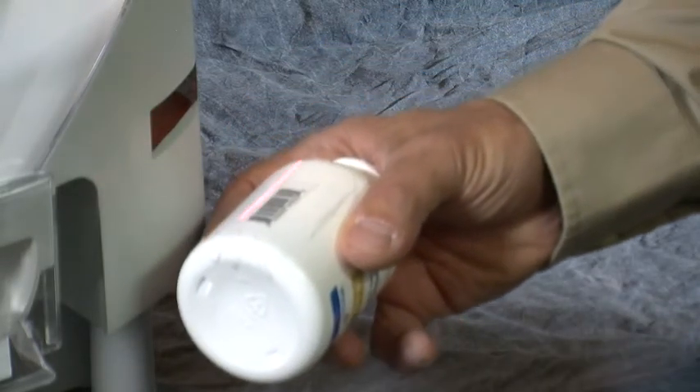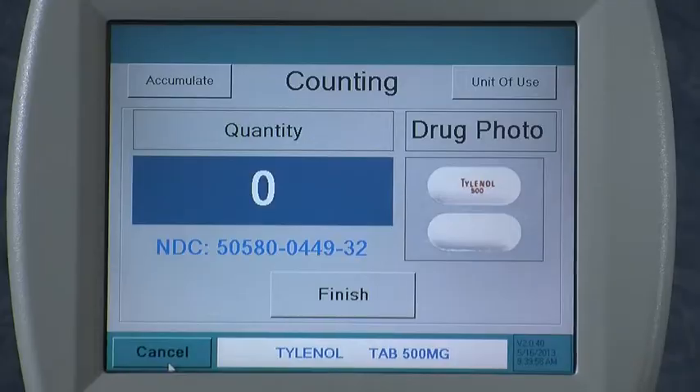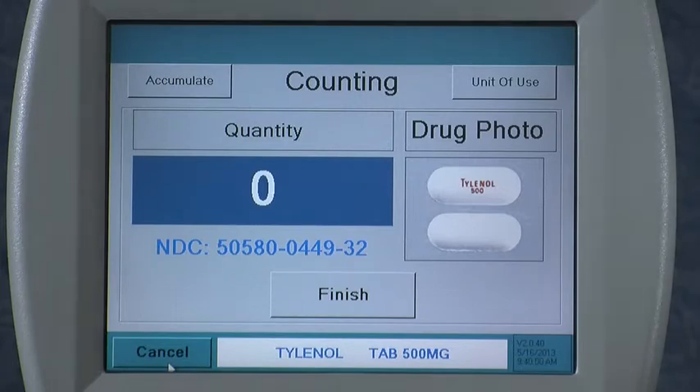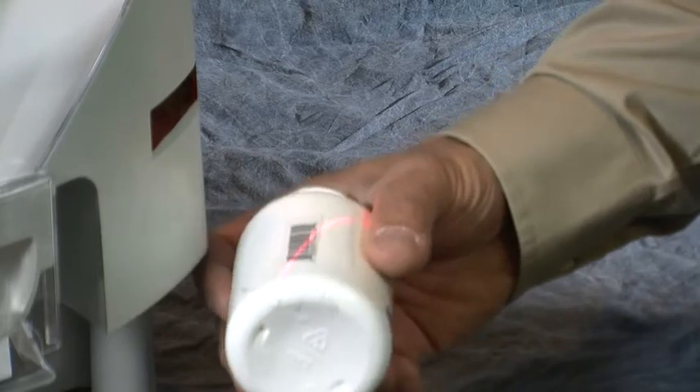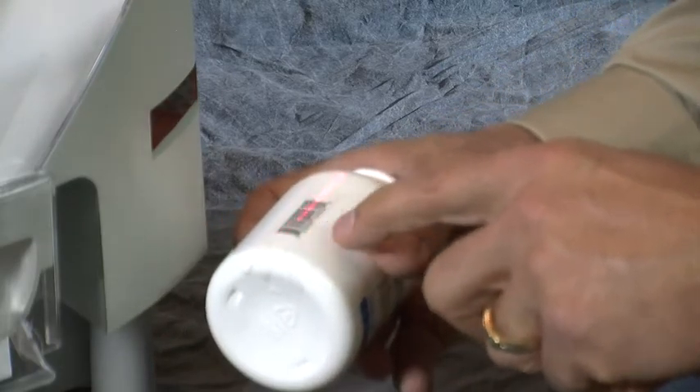Simply lower the barcode into view of the scanner and it should scan within a fraction of a second. Make sure that the beam is not going across at an angle and that it traverses the entire width of the barcode.